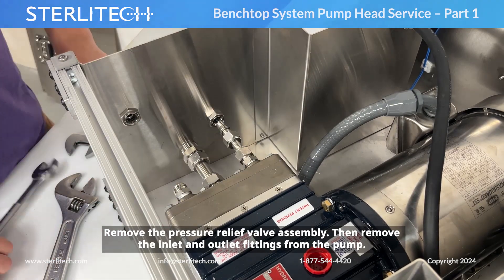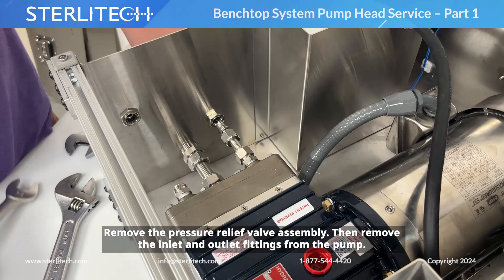Now I can remove our pressure relief valve assembly. Then I can remove the inlet and outlet fittings from our pump.